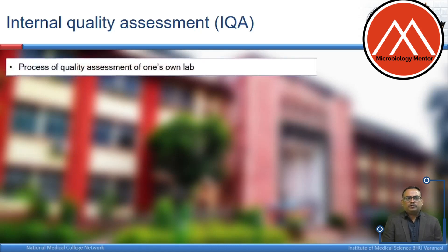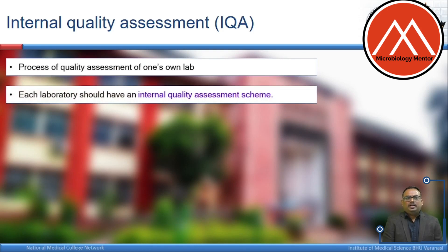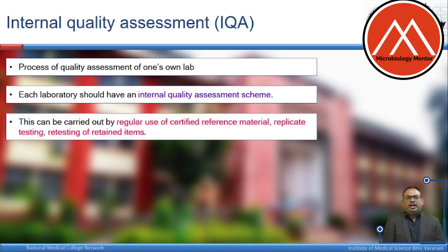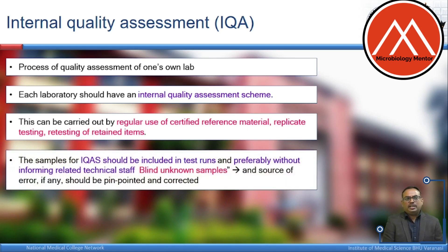Internal quality assessment is a process of quality assessment of one's own lab. Each laboratory should have an internal quality assessment scheme and through this scheme it should perform different activities. This can be carried out by use of regular certified reference material, replicate testing, and retesting of retained items as required. Samples for the internal quality assessment scheme should be included in test runs, preferably without informing the technician — as a blind unknown sample — and any source of error found should be pinpointed and corrective action taken.